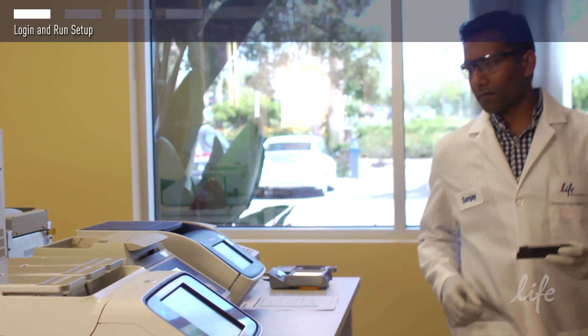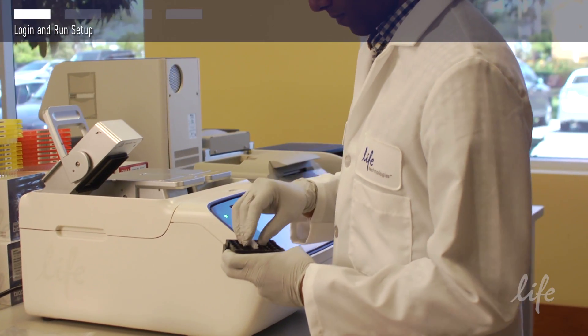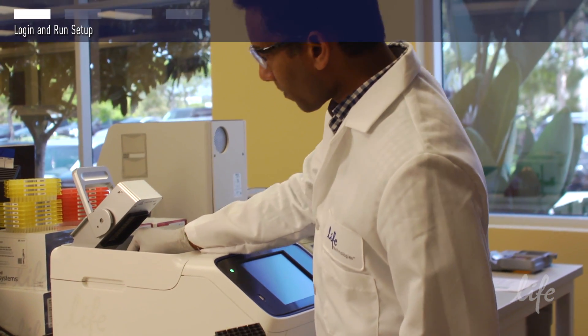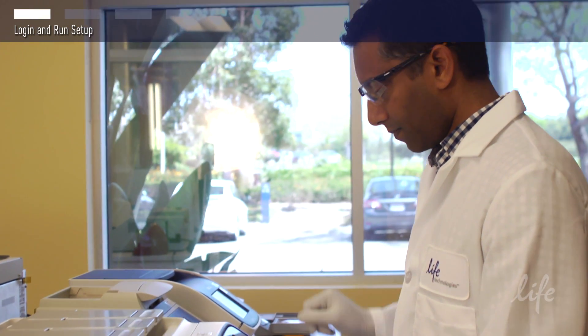The ProFlex PCR system is very easy to use. It is designed so that a novice user should be able to program the instrument without the use of an instruction manual in very few easy steps. In this video we will show you the simple steps to operating the ProFlex PCR system following the prompts.